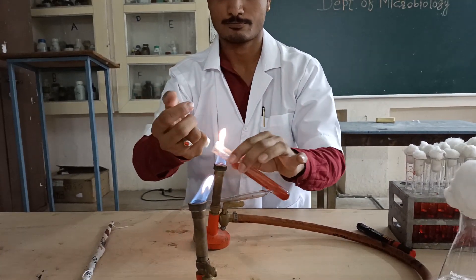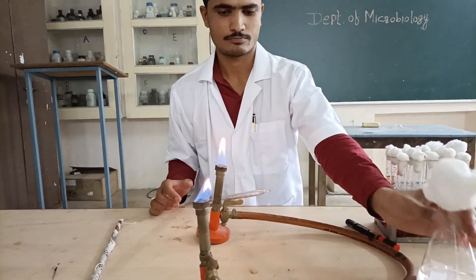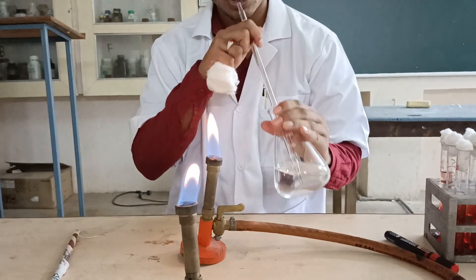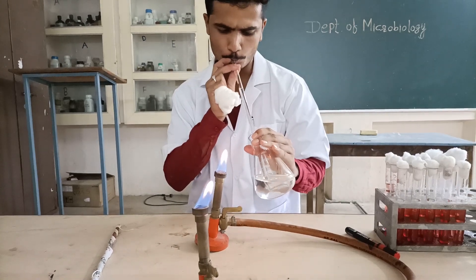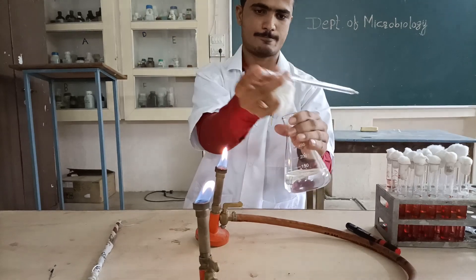Then we have to flame the mouth of the test tube and keep it aside, then inoculate the next test tube with 10 ml of the water sample. In this way we inoculate the remaining test tubes with 10 ml of the given water sample, and the experiment is performed aseptically.